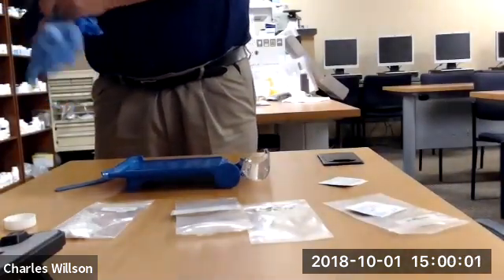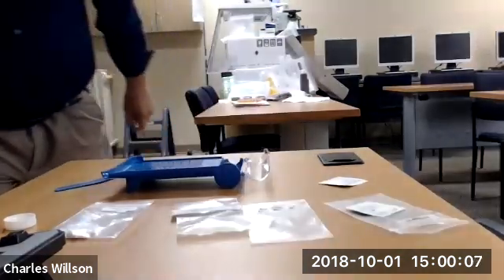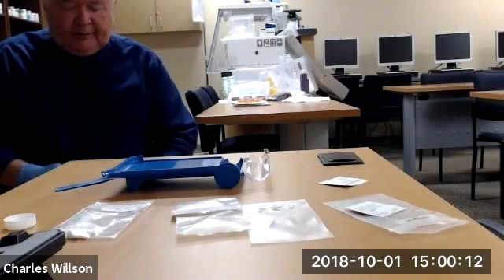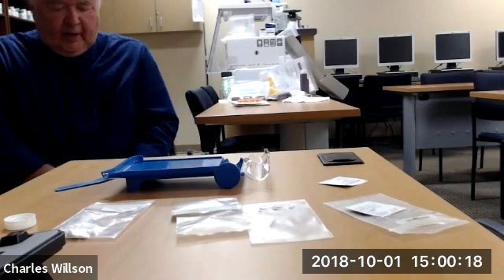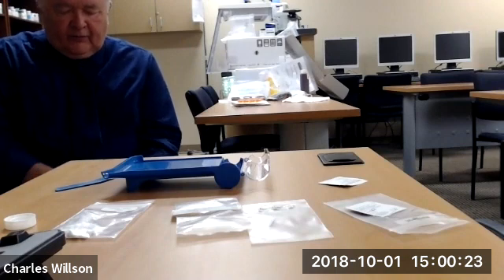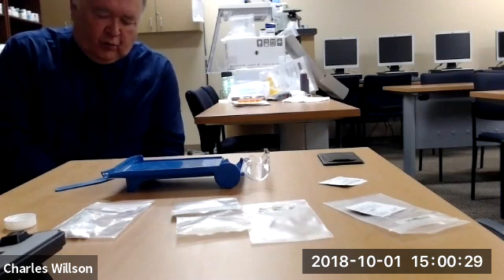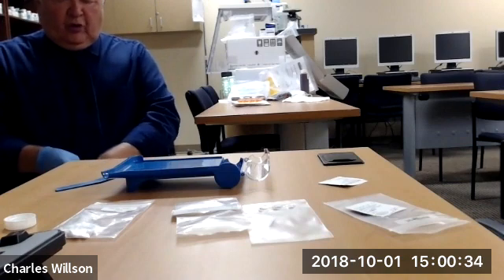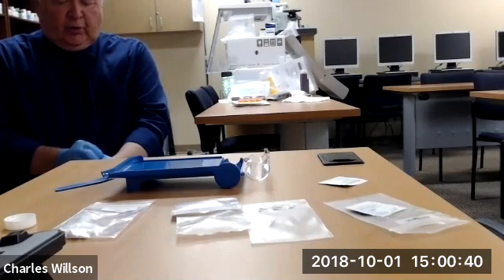Just a word for a minute. I worked in pharmacy for 29 years. Now, we do some things that require sterile technique, and we do some things where we require gloves. But counting a prescription is not one of them. So this is unusual, but just for the sake of what we're doing here, we're learning to manipulate things. We're learning to handle the equipment. So as part of the exercise, we're going to put gloves on.